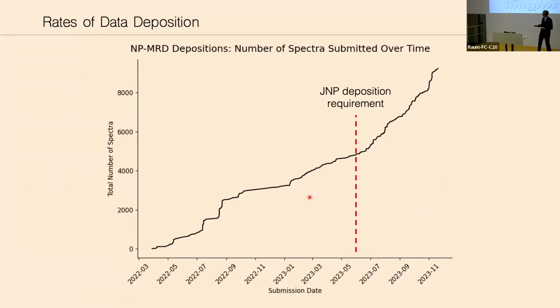But it is working. So we have had this running now for about, well, however long that is. It's sort of 18 months, but in the early years, a lot of that was just closed. Only our team really knew that it was there until we were testing it and building out extra features and things like this. We have accrued 10,000 NMR spectra, just shy. We're like 9,000 something at the moment.